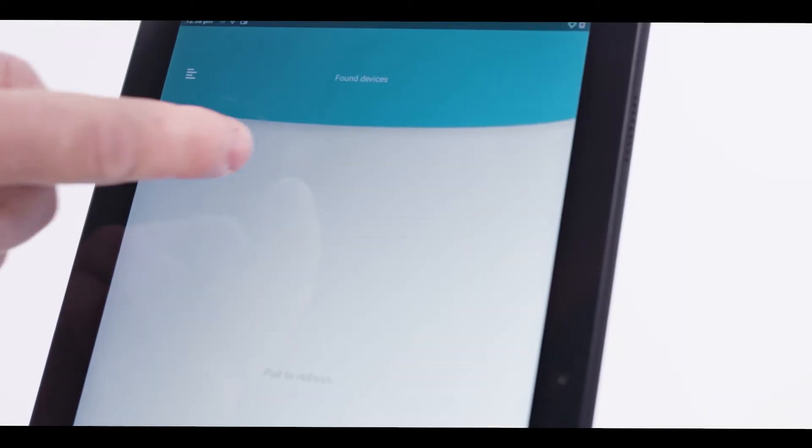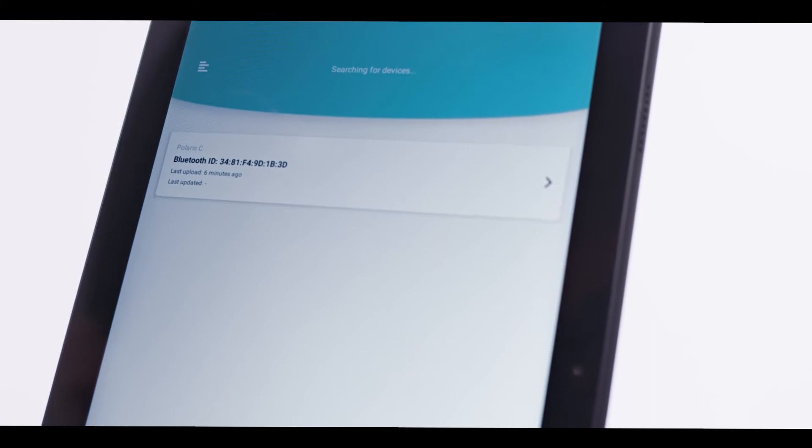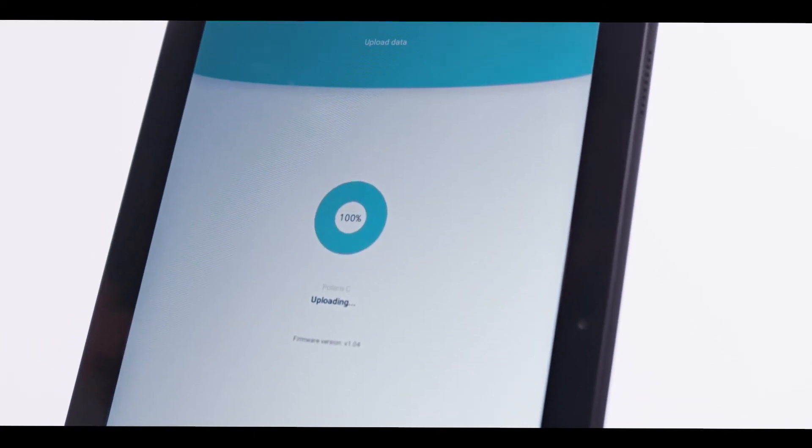The Polaris C is Bluetooth enabled, which means the data can be transferred via an app to OxyGuard's new cloud-based server, Cabalia. The app also ensures that the software for the Polaris C is always up-to-date.